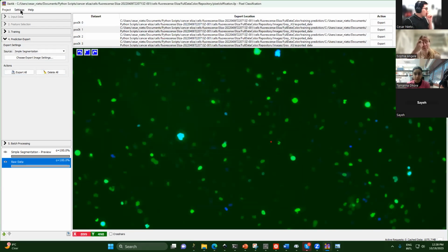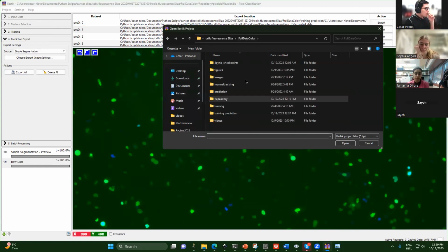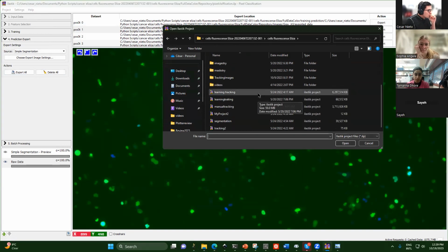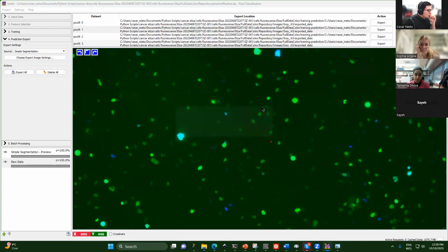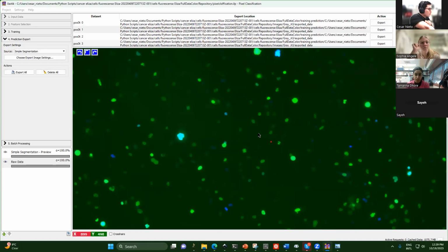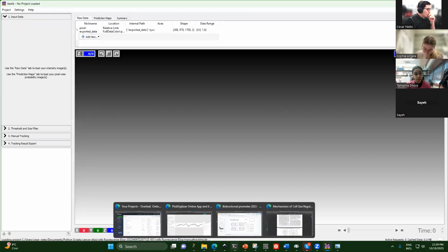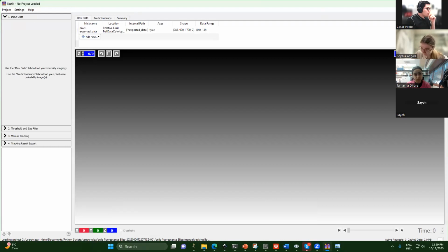Okay, once we export this, we're going to get the mask. With the mask, I don't have them here, I think. You open a new project.